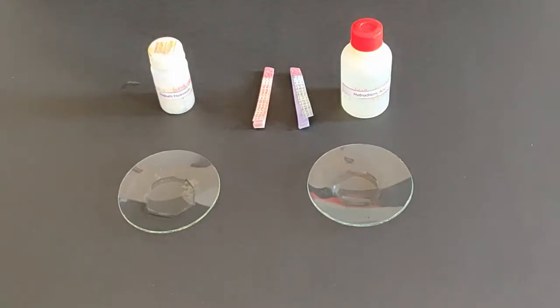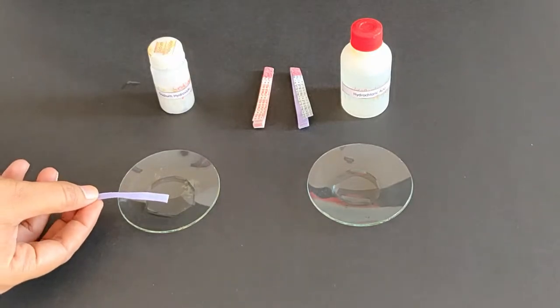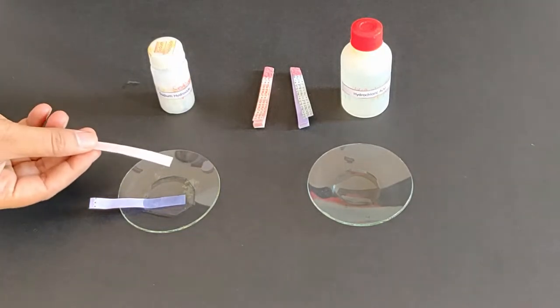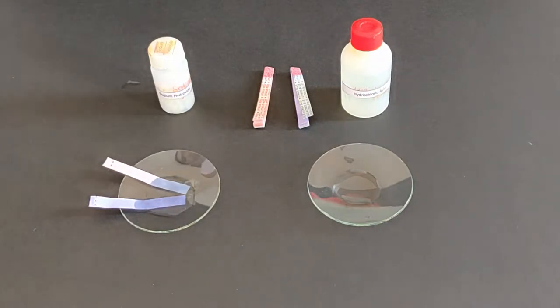Take some amount of the solutions in a watch glass. Dip both red and blue litmus papers in each of the watch glasses.